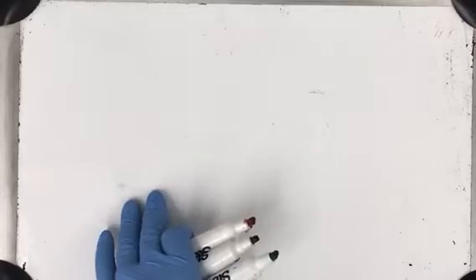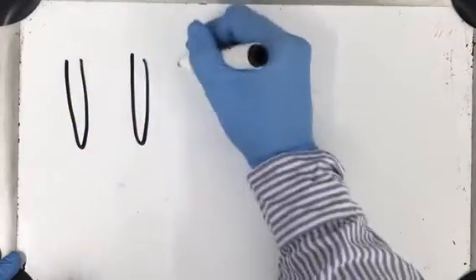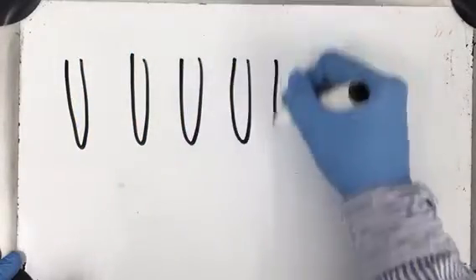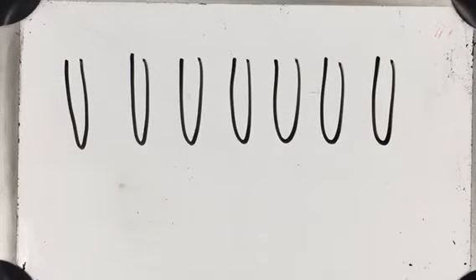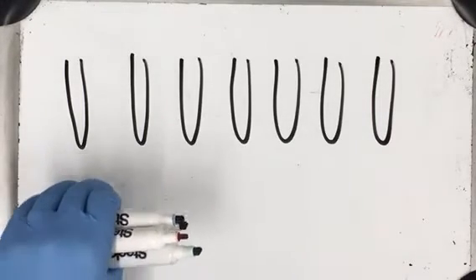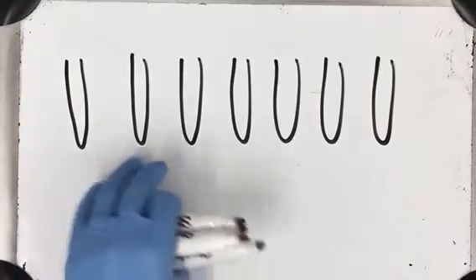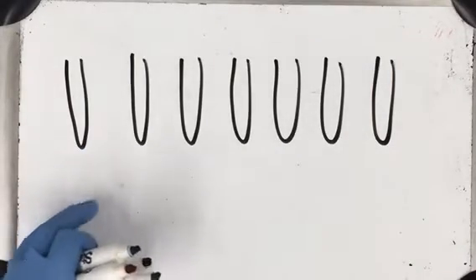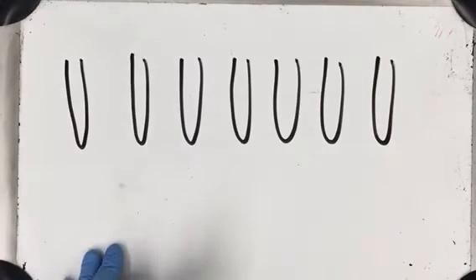So just give me a sec, I want to make sure I'm doing all these right. So tube 1, 2, 3, 4, 5, 6, 7. For each of these tubes, the first thing you're going to add is half a mil of buffer, so 500 microliters of buffer, 2 drops of chloroform, and 1 drop of SDS. This is going to serve as the buffer for the reaction.